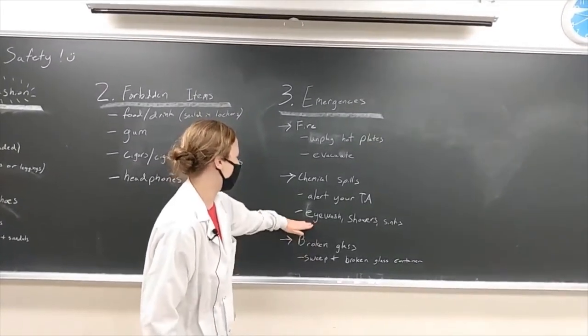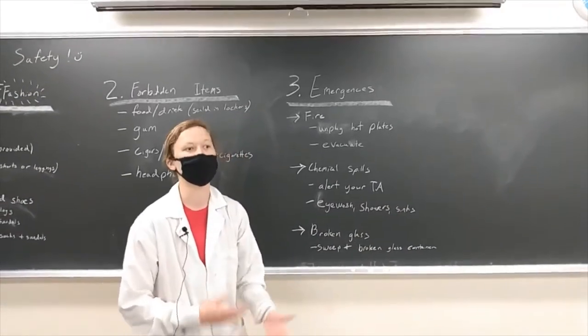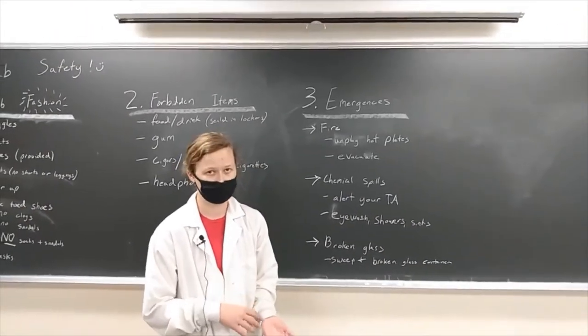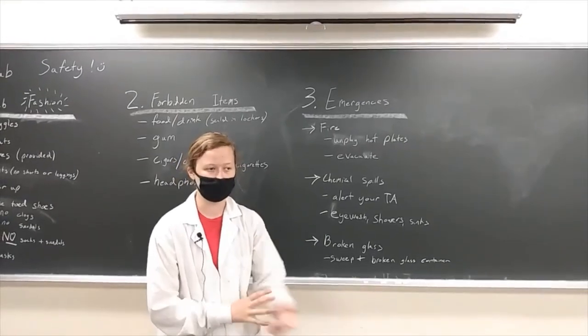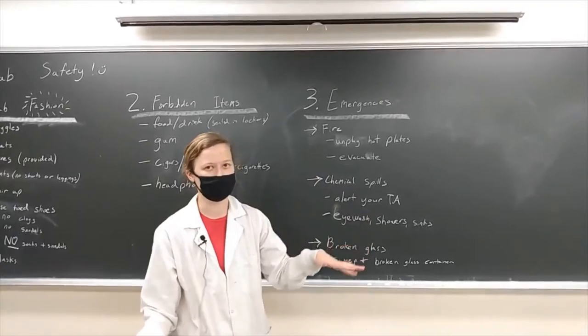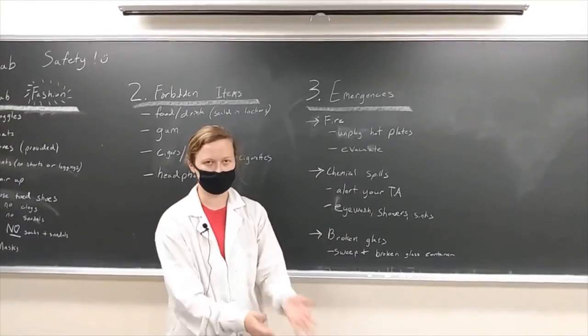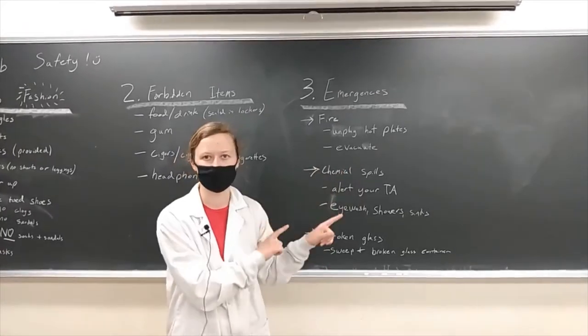And then we're going to talk about the eye wash, showers, and sinks. If you do spill a large quantity of chemicals on yourself, or if you spill just a little bit of a very caustic chemical, you'll need to rinse it off under a sink if that's an extremity that you can get under a sink, or if it's in your hair or something, in the shower. If it's in your eyes, it's in the eye wash. You have to stay under the water to rinse off for about 15 minutes. We'll check those out in just a second.